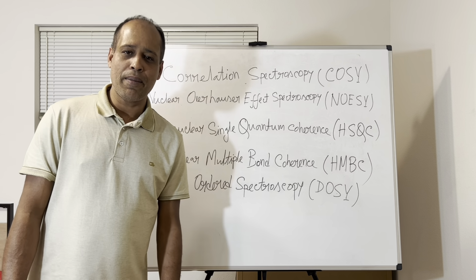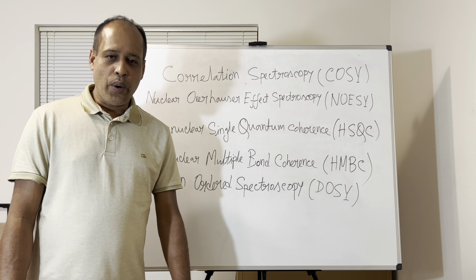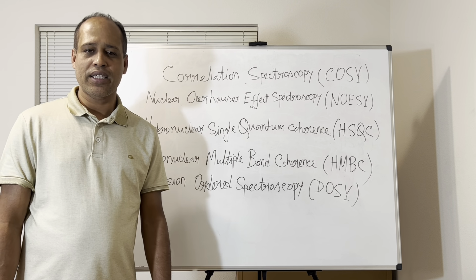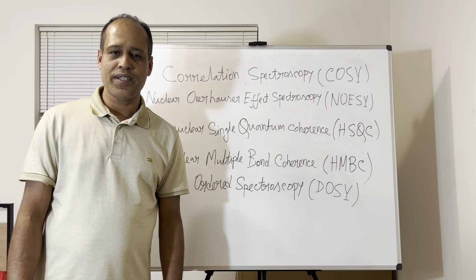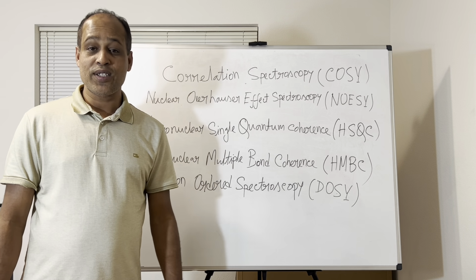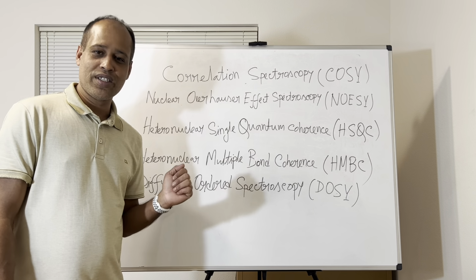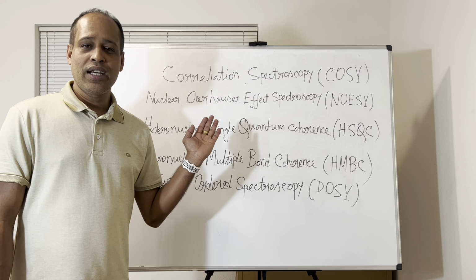But recently I have got a couple of requests to make videos on some topics, especially 2D NMR, and also TLC plates, different types of TLC stainers, and so many other things. So slowly I'll make them, I promise, but today I'm going to start with 2D NMR.